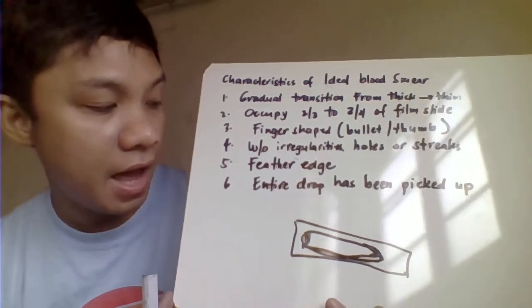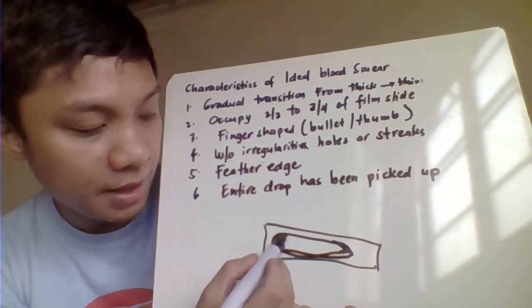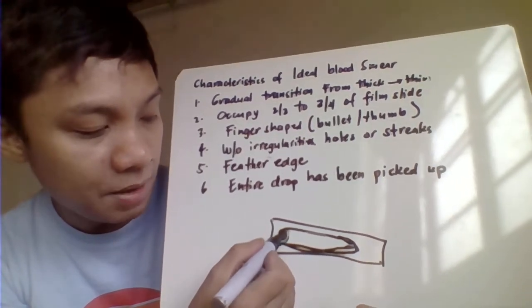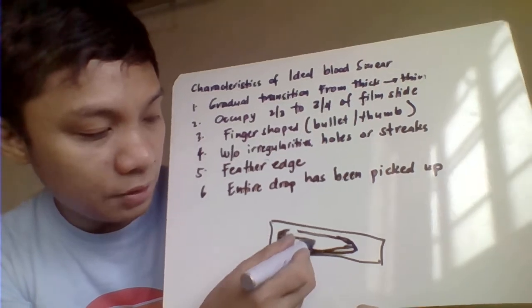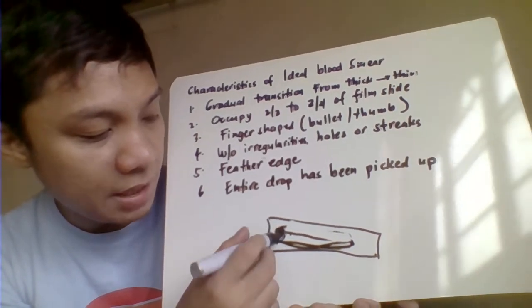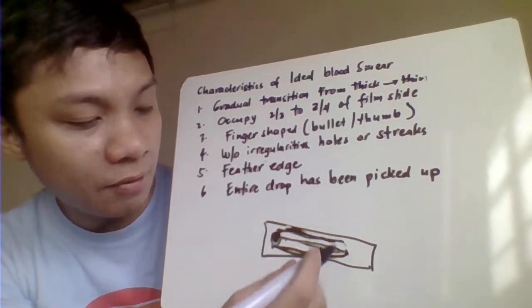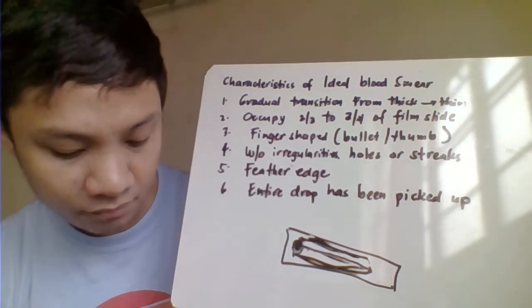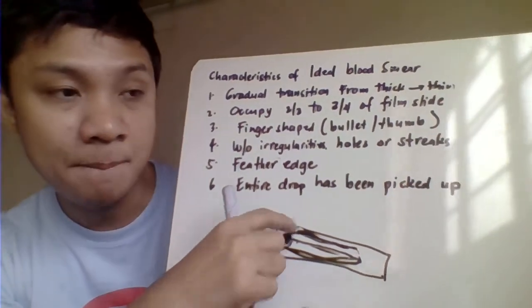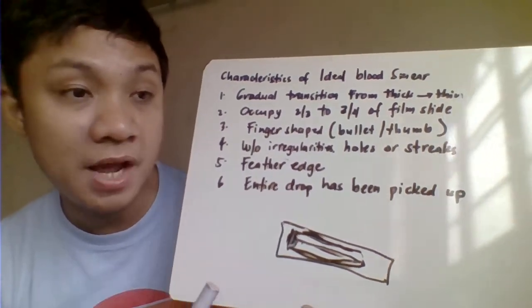Another one should have here the feathery edge, and you should pick up the entire drop of the blood. Again, kung dito ang drop ng blood, kunin mo yung lahat para magkaroon ka ng even na distribution ng blood. Kasi pag hindi mo na pick up lahat ng drop ng blood, so ano mangyayari? So, ganito lang yung makuha mo, diba? For example, ito lang, hindi mo na pick up lahat, so ganyan na lang yung makukuha mo. Not able to have the required na width ng film natin. So, pag na-pick up tayo ng drop of the blood with your spreader slide, wait muna na pumunta lahat dito sa edge ng ating spreader slide before you try to spread your blood.